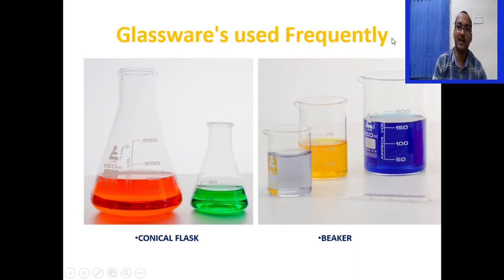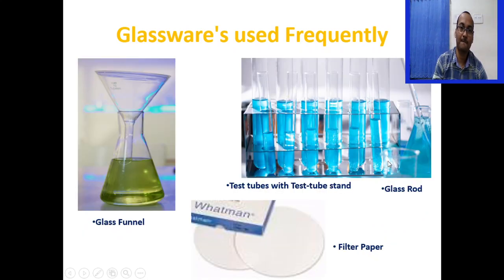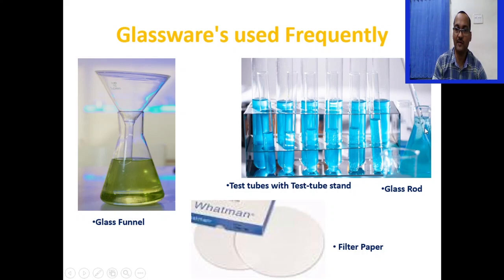The glasswares used frequently inside the chemistry lab include: conical flask in different sizes, beaker in different sizes, volumetric flask — where the lower meniscus of the liquid should touch the marked line — measuring cylinder in different sizes such as 100 ml, and reagent bottle where you store different chemicals. There is also a glass funnel and filter paper, used together to filter different reaction products, a test tube stored in a test tube stand, and a glass rod used for mixing or stirring.